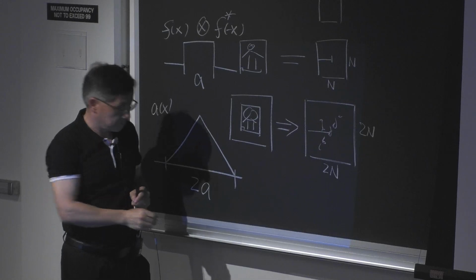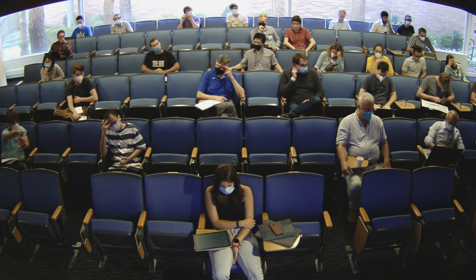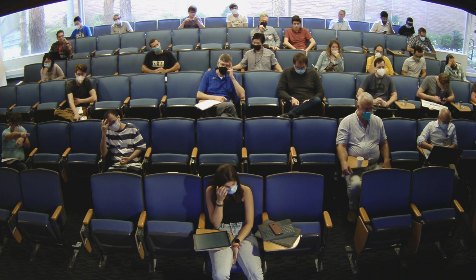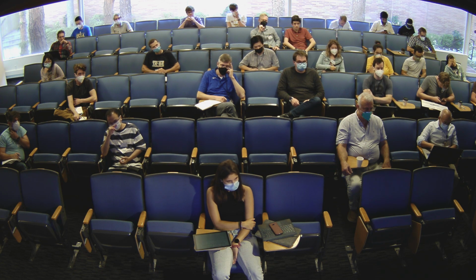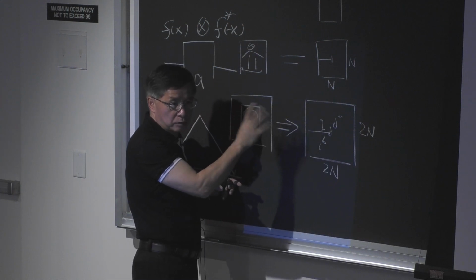So mathematically, the point is that these functions which are representing this figure, in the middle, can be periodically extended outside of the square, and that's why the fast Fourier transform works well. But when you do it on the larger square, they are no longer orthogonal, right? Inside that square, and so you get more information out. But this is still FFT. If padded with zeros it is still FFT, so this is still orthogonal.